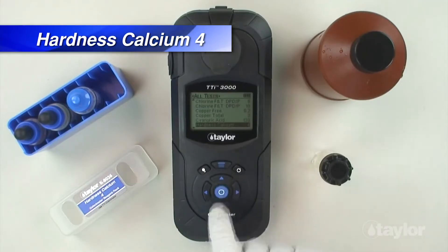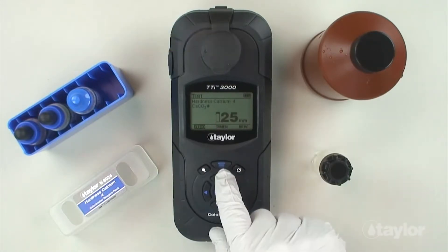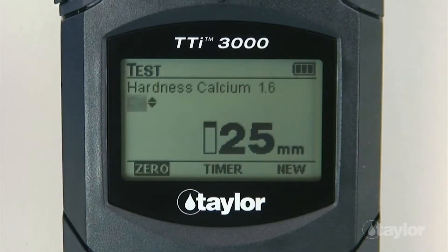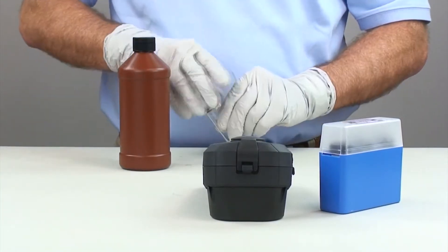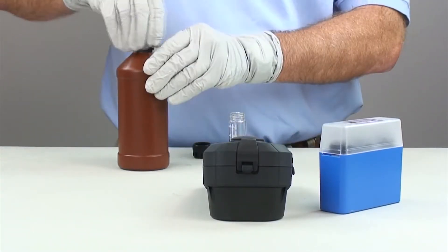Then press enter. Select a chemical form — calcium carbonate or calcium — for expression of test results using the scroll arrows. Rinse and fill the 25-millimeter sample cell to the 20-ml mark with a sample.